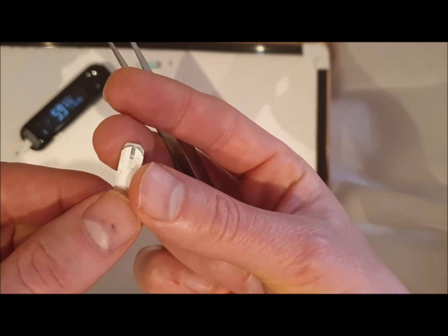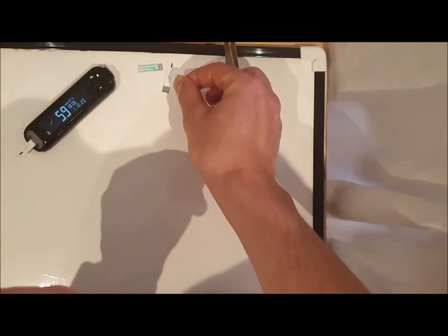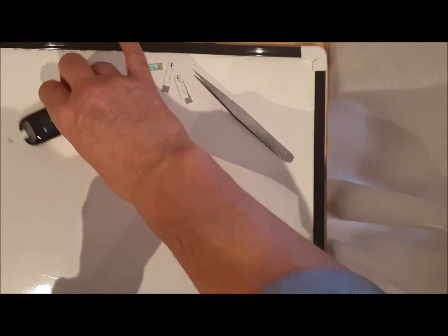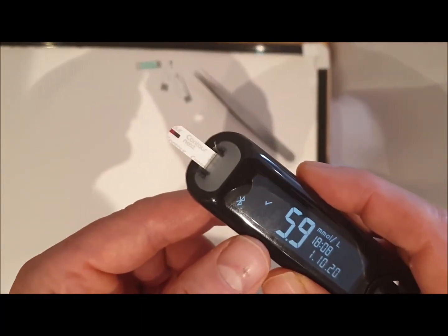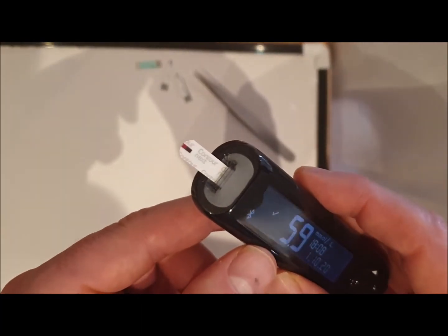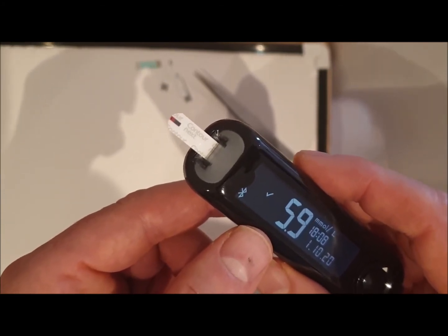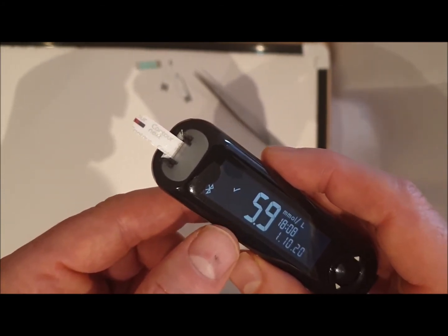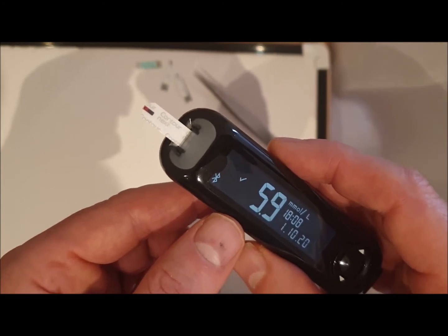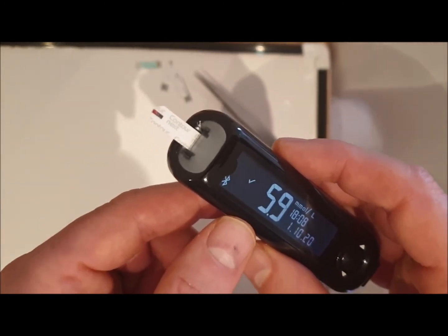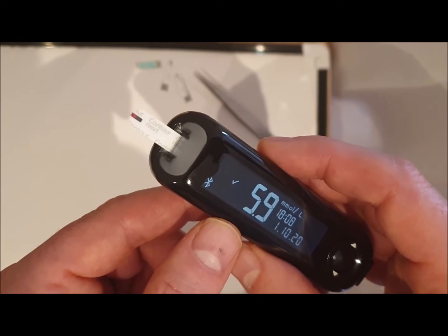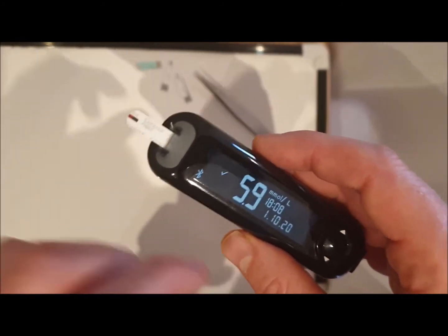These sample volumes can be as small as 300 nanoliters, so they're really quite small. A nice thing about electrochemical biosensors in general is they really don't need much sample in order to operate. They can be quite small.